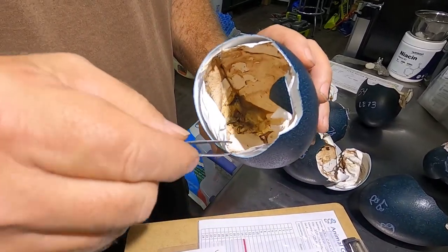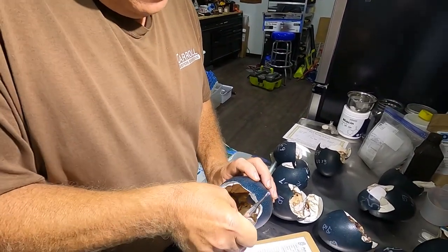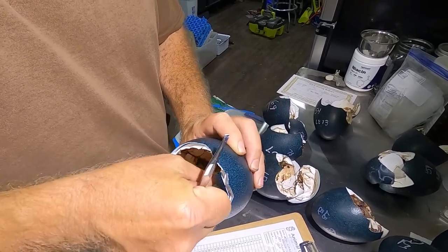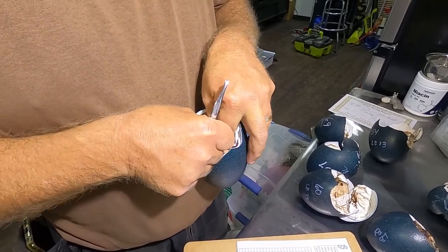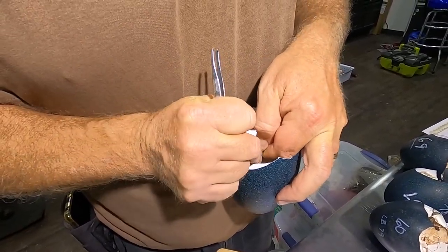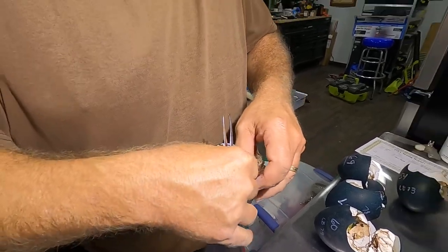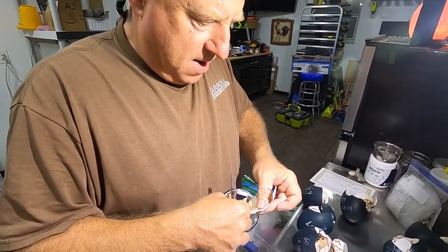You take whatever device you want — a hemostat, or I usually use fingers honestly — and I tear a good chunk out. I try to leave a little bit behind, so I'll just kind of tear it off. I try to leave a good chunk behind so that if we need to run this again, we can pull another sample and run it again. Sometimes they come back inconclusive.